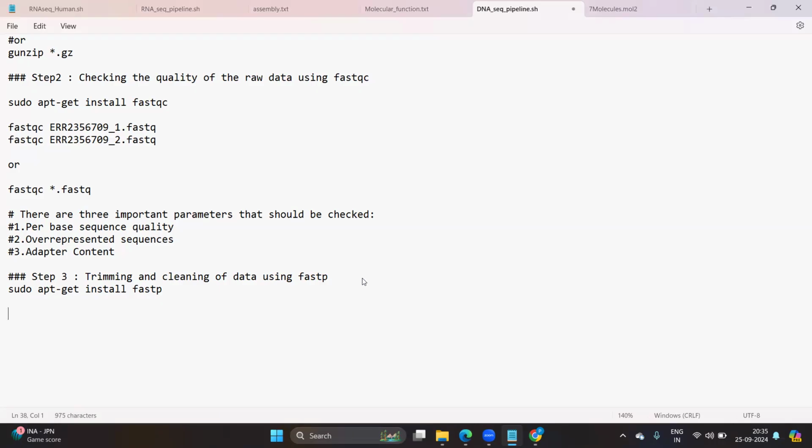Tell me, how can I open the fastp manual, which command do I have to run? Tell it to me in the chat box, as a direct message to me, not for everyone.